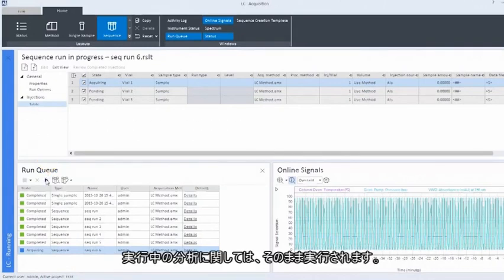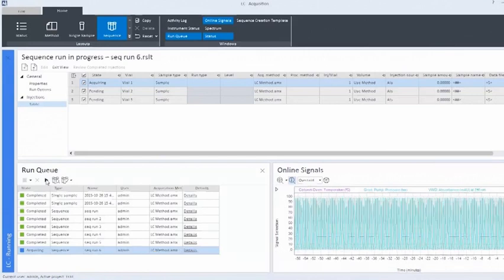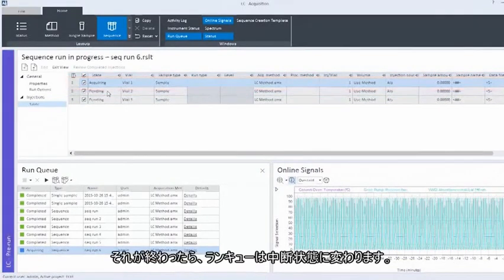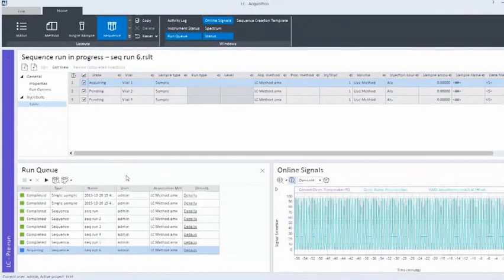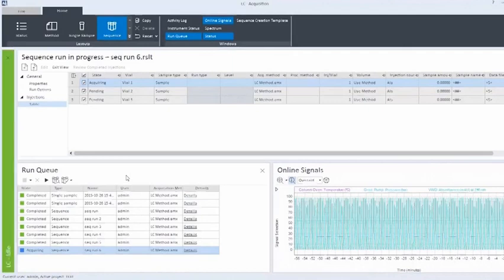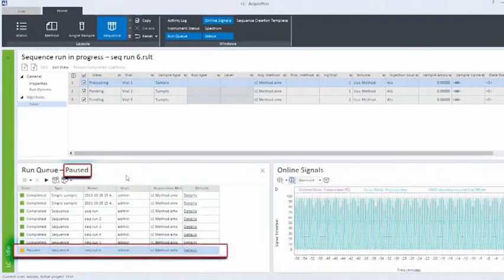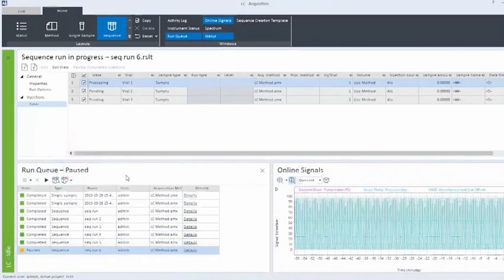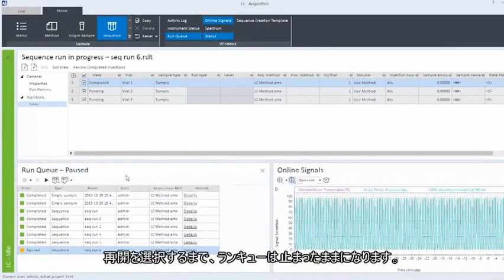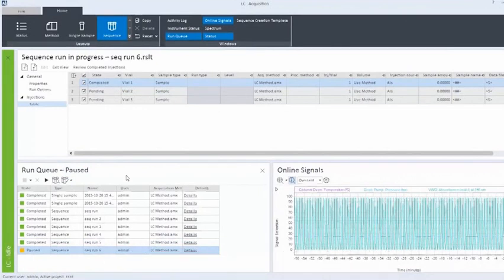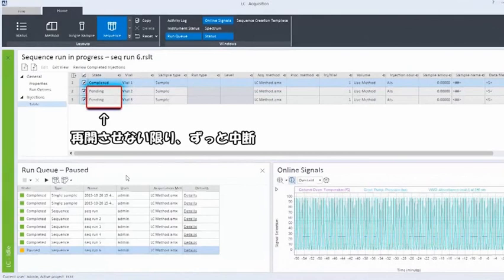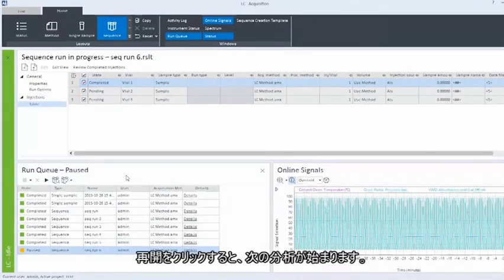The currently acquiring injection will continue acquiring. Once it is finished, the run queue will switch to the pause state. The run queue remains paused indefinitely until you choose to resume. Click resume and the next injection begins acquisition.